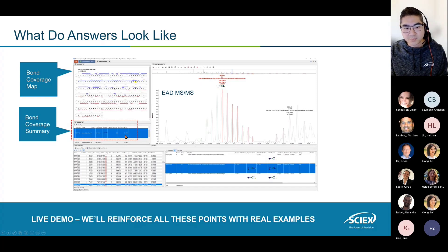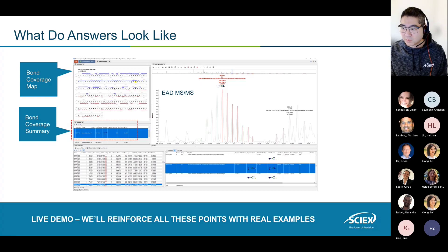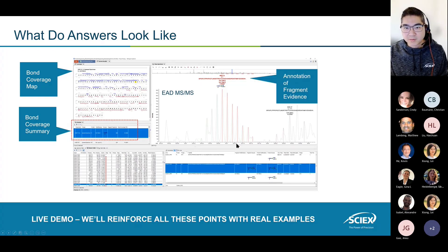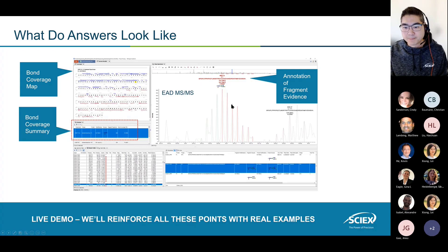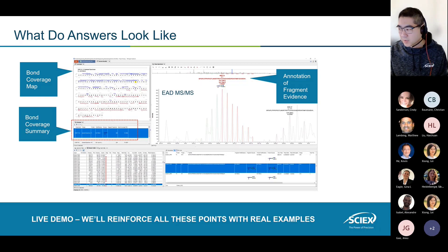Another part to focus on is the bond coverage summary, which also comes as part of the UI. The important metric here is the bond coverage percentage — 70%, 80%, whatever you get depending on your measurement. This is useful when you start tuning your methods for the first time during acquisition, trying to pick the best method. The last part to focus on is the actual annotations of real ion evidence. The technology is based on recognition of isotopic patterns, labeling them with the ion type, the peptide that ion represents, and any modifications you're trying to confirm.